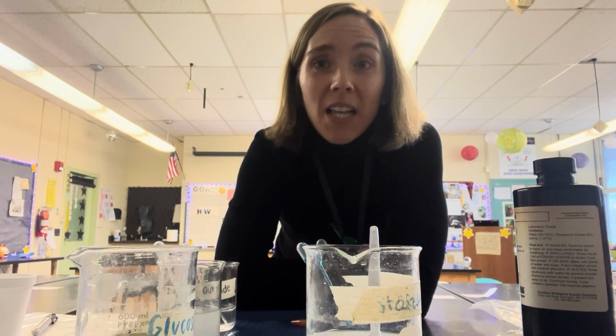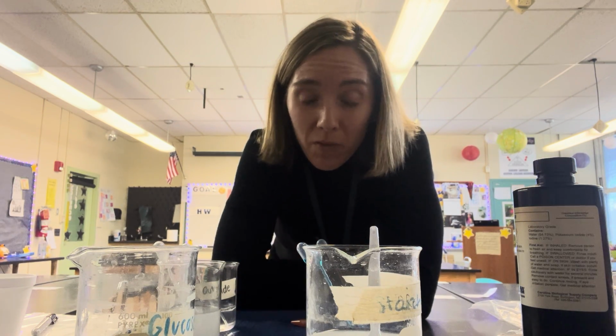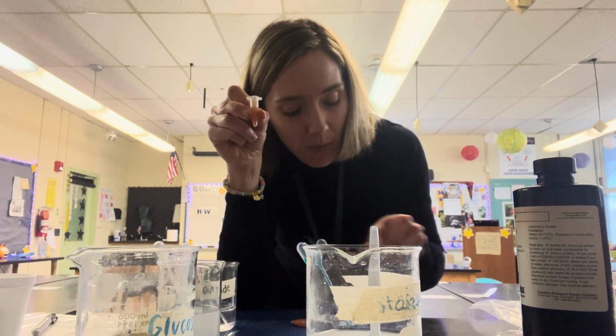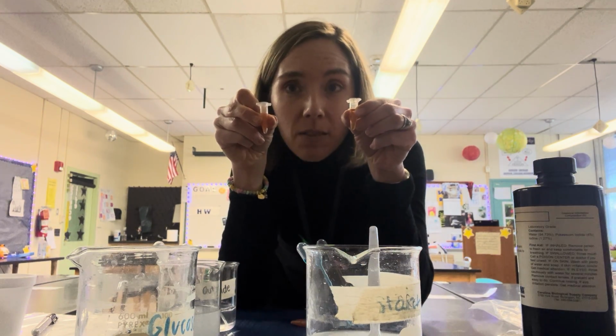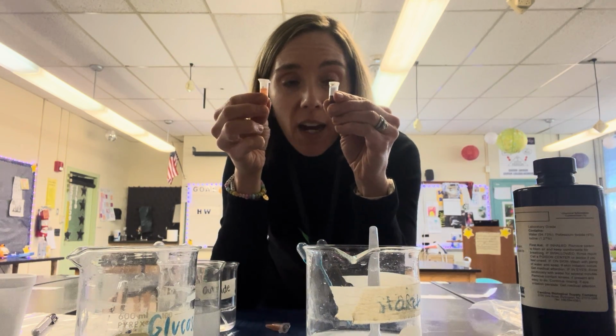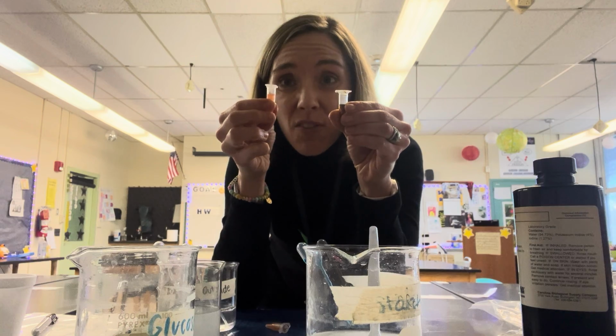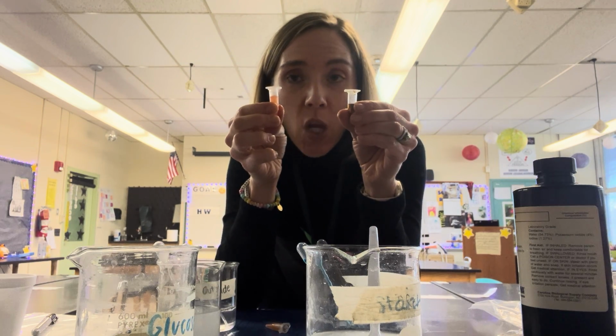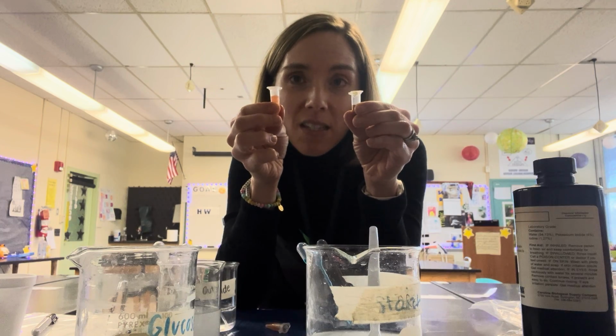So what do these findings tell us? They tell me that my glucose was able to make it out of the tube because the Benedict's reacted outside of the tube, but my starch could not. Inside the tube, there was still some starch there, which makes sense because it didn't leave, but there's also some glucose there as well, so not everything left. Hopefully this helps you understand this activity better.